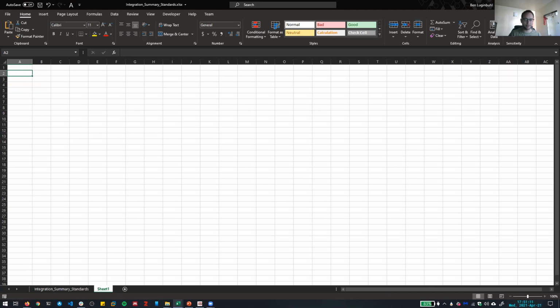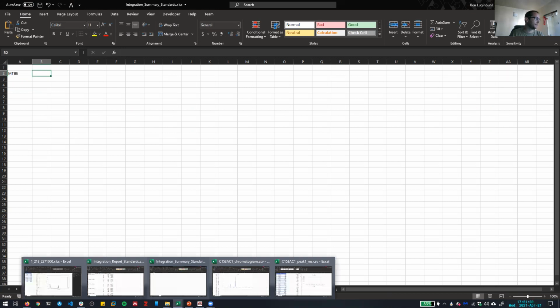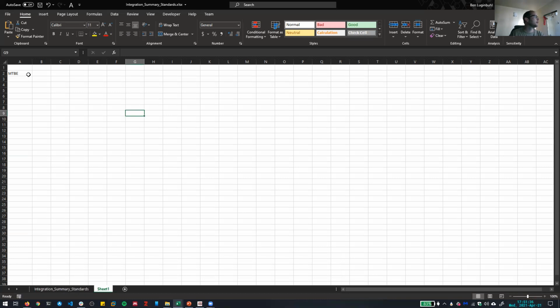Let's see, on page 4, step 2, prepare the analyte standard solutions. So I'm going to go through and basically just copy that table and the volumes and stuff. So we've got, let's see, maybe we want to do it some other way. Let me think here. Yeah, so we want to go the other way around.